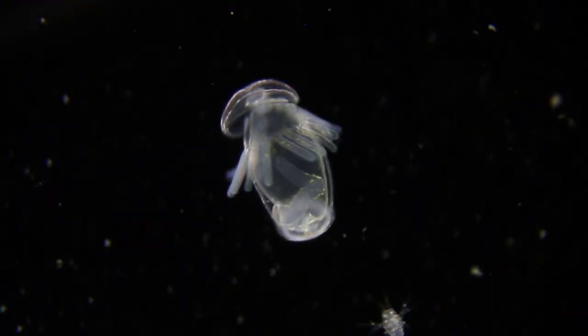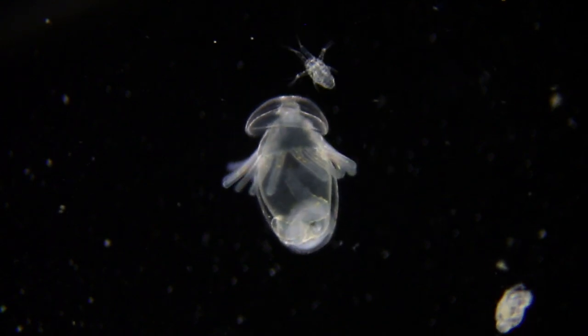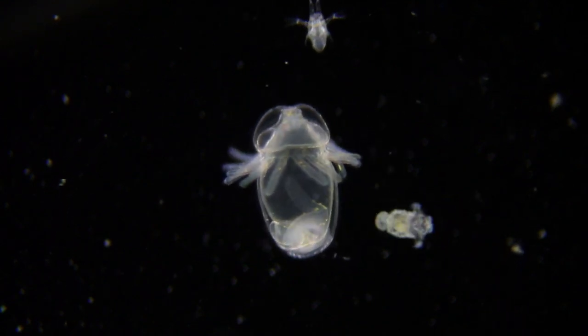This is a phoronid worm larva, a young horseshoe worm in its free-living larval stage.